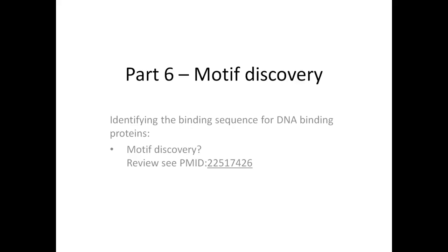Epigenetic signals such as histone marks may be associated with sequences with certain characteristics, but not a specific motif, or at least not one that I know of. Prior to a ChIP-seq experiment, the binding motif of a transcription factor may not be known, in which case the discovery of a novel motif is notable in itself. But even if the motif has been previously published, the experiment may have used a different tissue or cell type, and the transcription factor may exhibit different binding preferences.